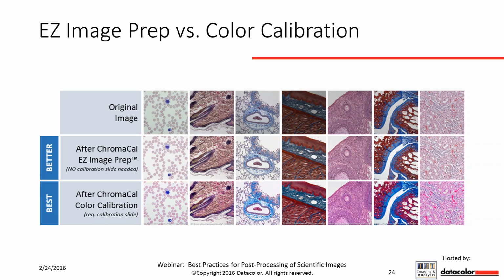If you opt to also get the hardware with the software so that you can image the color standard, you can then actually get colors that are closer to what you see from the samples, and more importantly are standardized to a color target. So now I'll hand this over to Mark, and he can tell you more about ChromaCal.